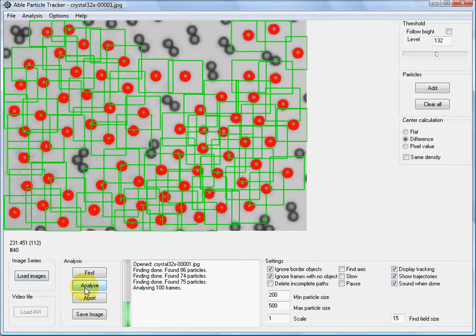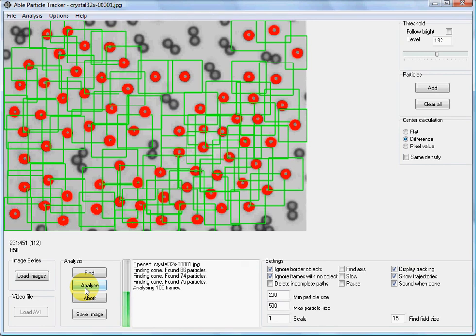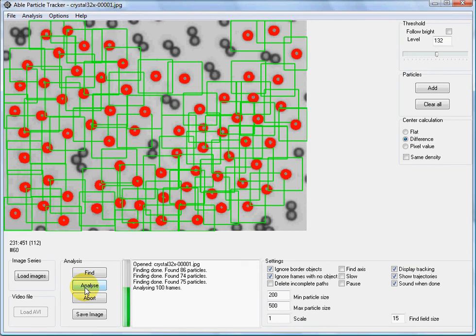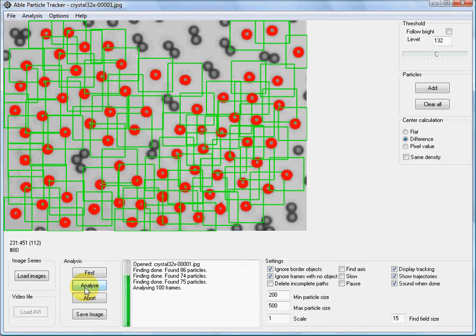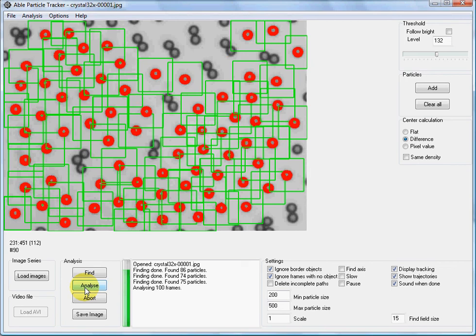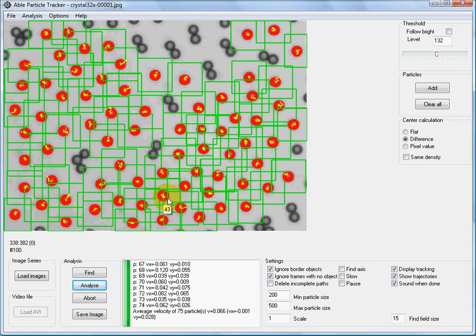The program is tracking 75 particles in 100 frames. It takes some time, and now it has finished. You can see the trajectories of the particles.